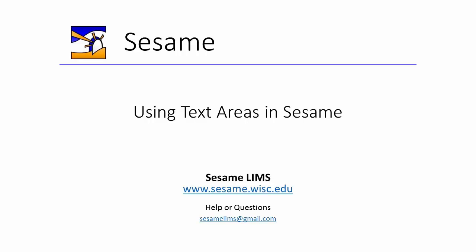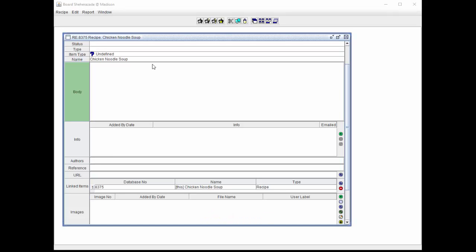Hello, and welcome to this video tutorial on how to use the text areas in Sesame. Text areas are used across the views for fields that can hold multiple lines of text. The size of these fields can change to reduce the need for scrolling and maximize the use of the display or monitor area.